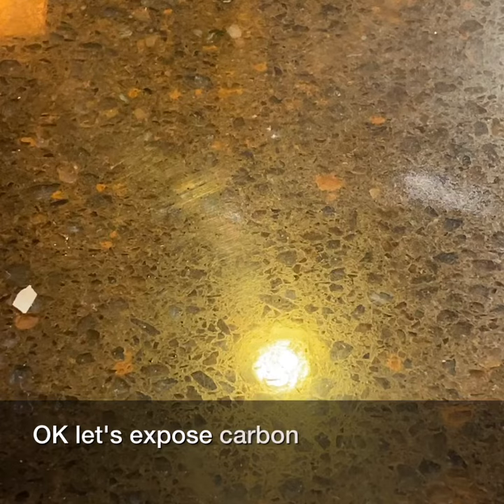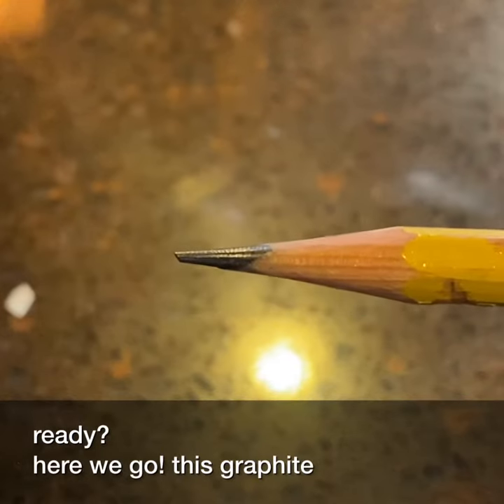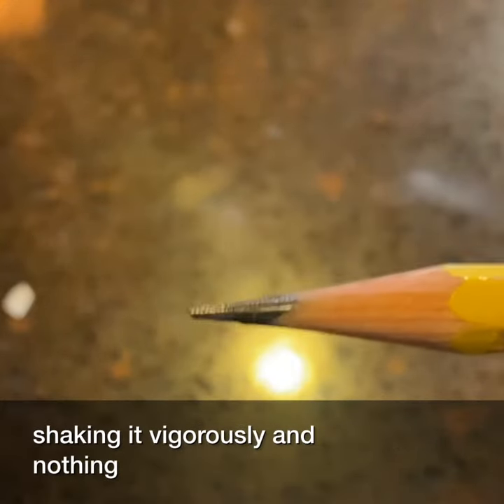Okay, let's expose carbon to oxygen. Here we go. This graphite — 100% carbon. Exposing it to oxygen by shaking it vigorously, and nothing happens.